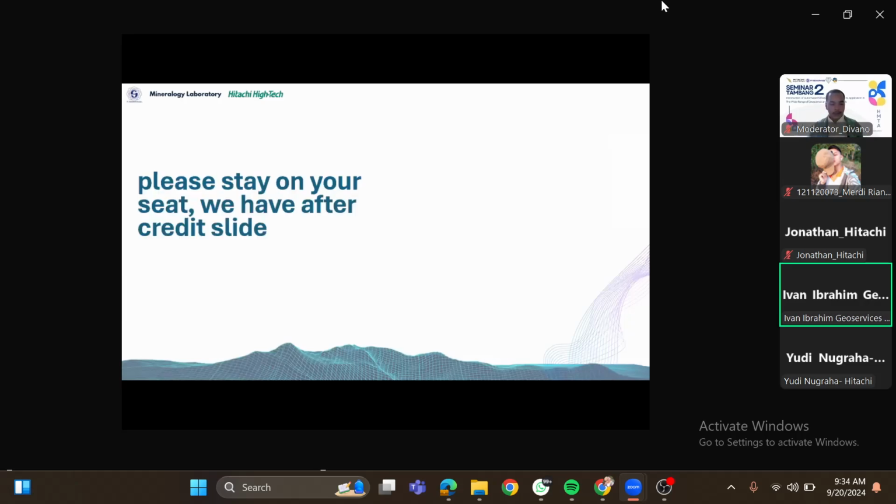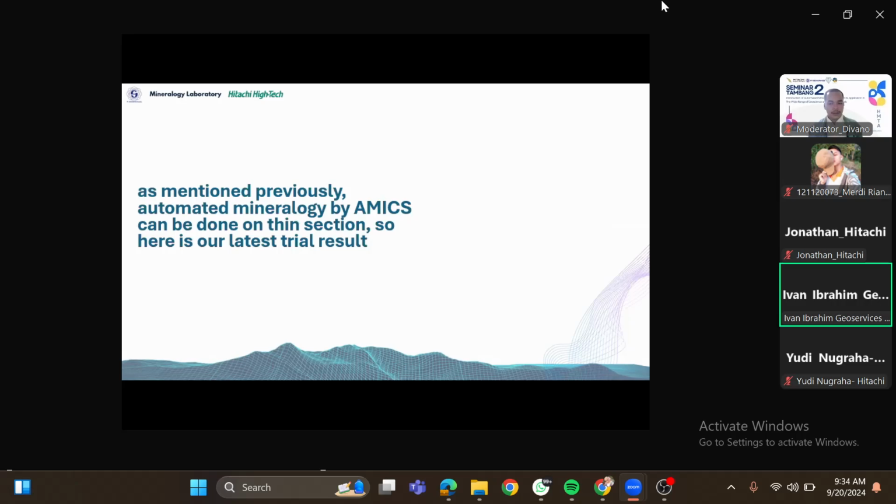And next, please. Please stay karena saya mau kasih, nggak terlalu kejutan kali ya. Oke, next. Jadi kami di geoscience coba trial di thin section karena kita penasaran. Sebelumnya kan petro itu basisnya ya dari optical microscopy, behavior on lighting system-nya aja. Jadi gimana sifat optisnya. Terus kalau kita upscale, kuantifikasi kayak gimana.